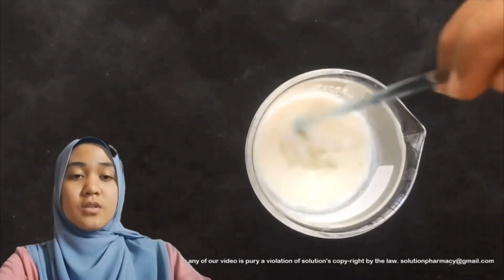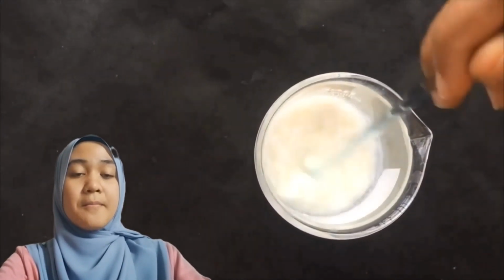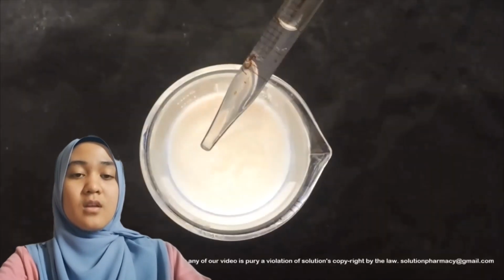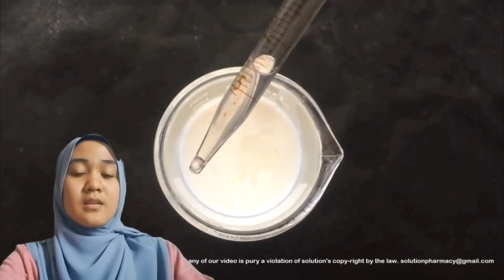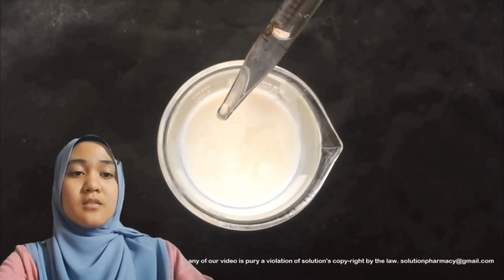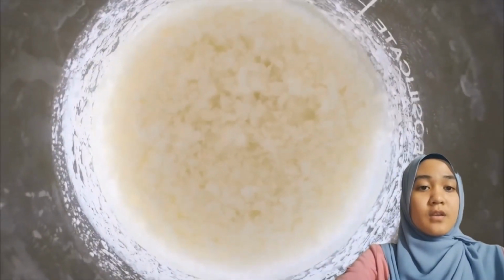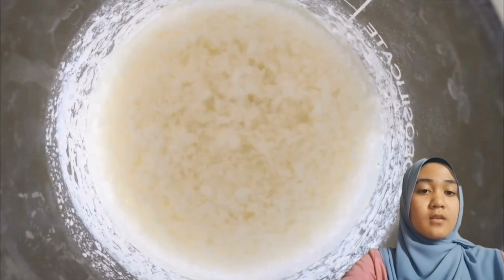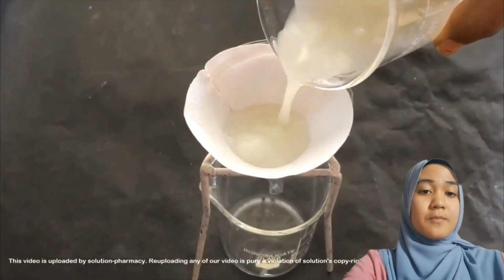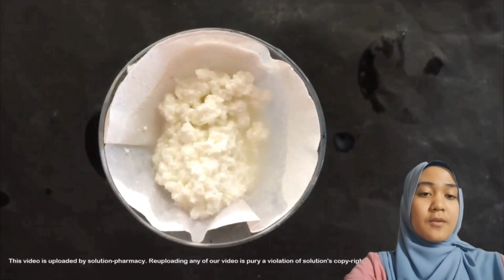Then stir the solution with a glass rod to ensure that the acetic acid is thoroughly mixed with the milk. If the casein has not yet precipitated, keep dropping the acetic acid into the milk and stir with a glass rod. If the casein has completely precipitated, allow it to cool for 5 minutes at room temperature. Using a muslin cloth, filter the precipitate. Wash the precipitate with water several times.